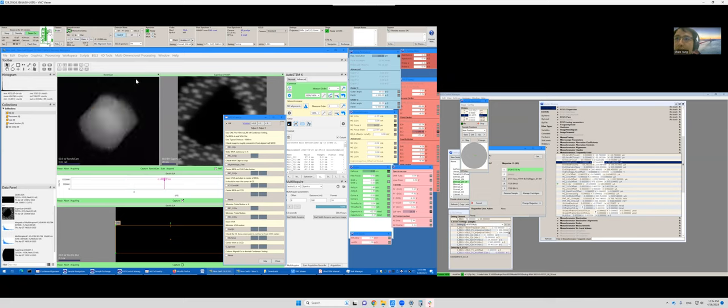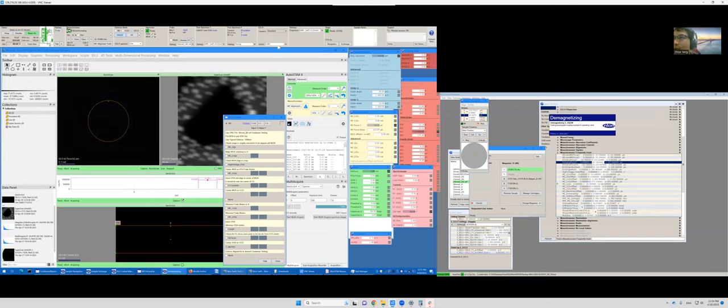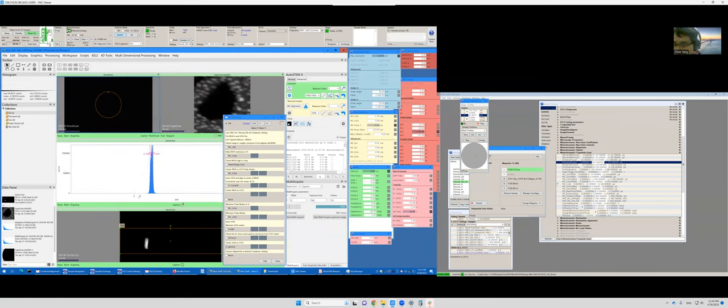Let's put VOA in and then switch the mode to EELS. And now you want to make sure you're using the correct EELS dispersion. So normally for very high energy resolution, you want to use 1 meV per channel, which is 0.001 eV per channel. And you want to make sure this is showing EELS REF, this is showing CL 21 millimeter, this is showing 19 milliradians. And now look at the detectors, which is the EELS detector.